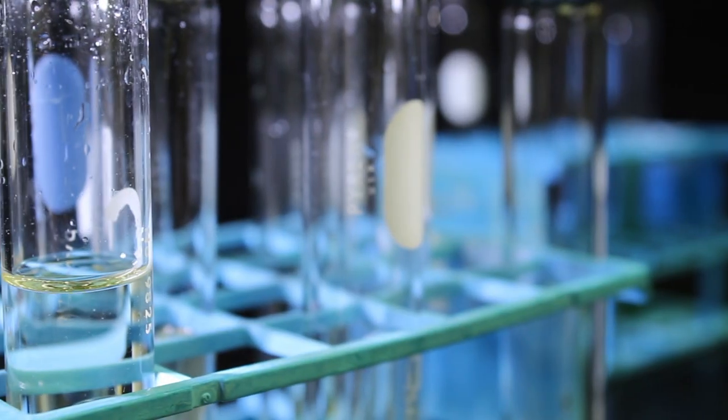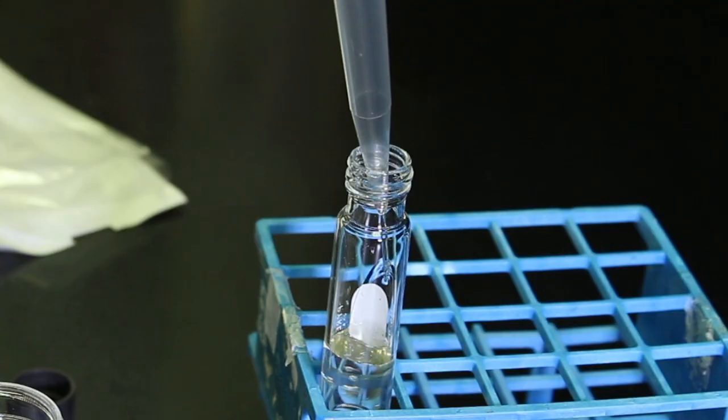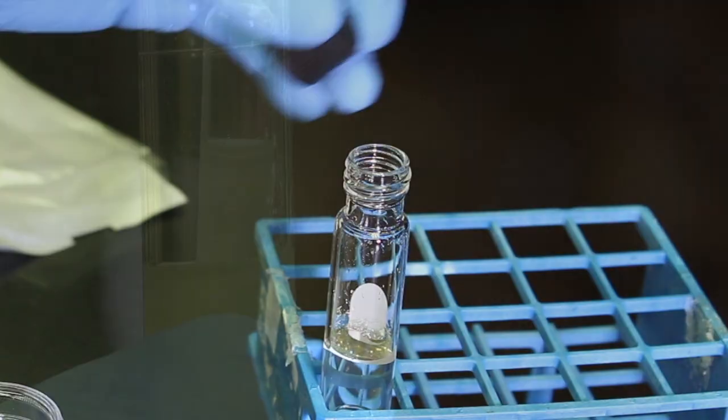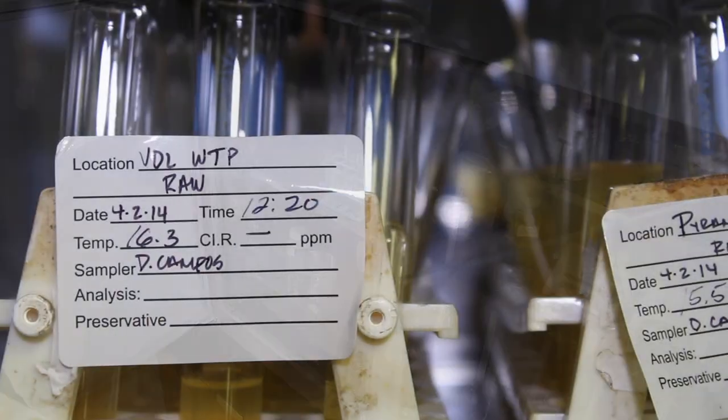Often, this test is performed on multiple tubes, instead of the single ones shown here, and sometimes with smaller sample sizes than the 10 milliliters. Once the sample is in place, the test tube is swirled to mix the contents and then it is placed in an incubator.